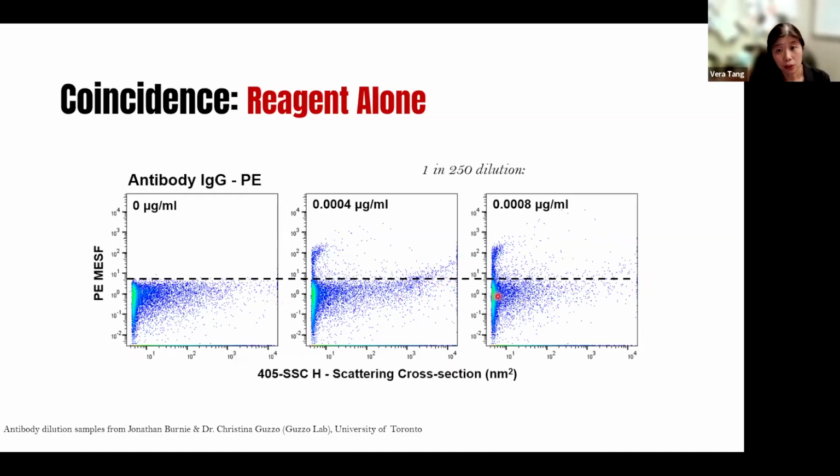If you do a serial dilution of your fluorescent sample and it essentially looks the same throughout the dilutions, that's how you can tell. And there's ways to graph this quantitatively. So you graph your concentration versus the fluorescence intensity of the particles, and you should be able to see a straight line correlation, right?